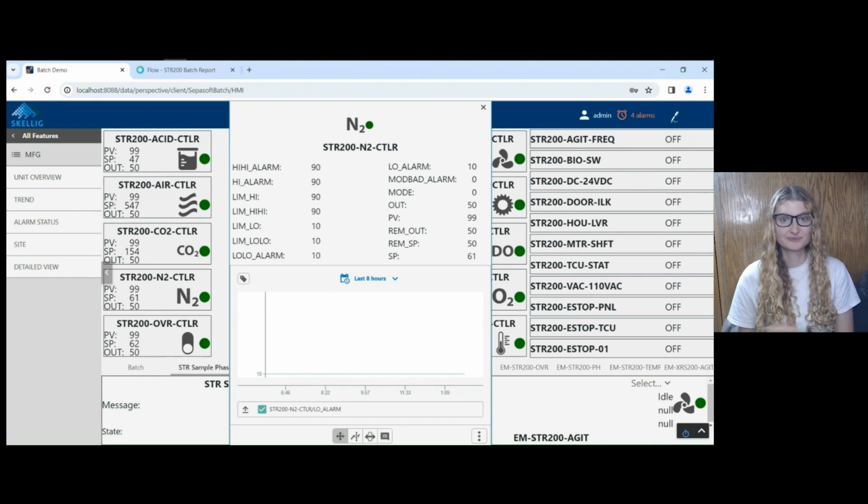This is different. I'm not using Code Assist to visualize this data. In fact, I'm not even using Canary to visualize this data. By the way, Canary does come with its own web-based trending called Axiom, which is great. I have nothing against it. But for this use case of a faceplate, I wanted to use Ignition. And that's the power of a UNS. Data can be used by any nodes that are connected, which lets me pick the best application for the specific use case.